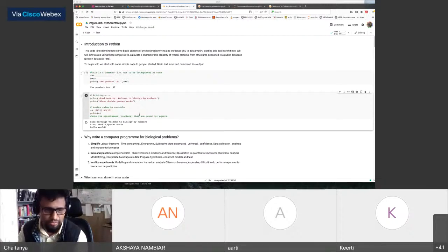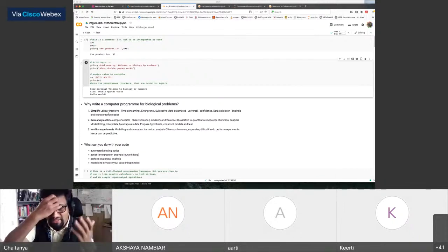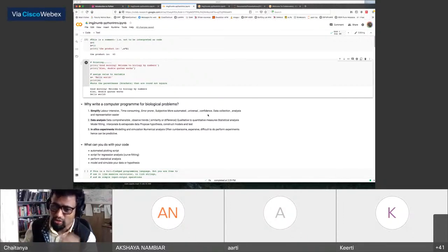are your output. So of course, why write computer programs for biological problems? You're here in this course, so I assume you don't need to know this. You don't need this to be explained to you, but it is simplification of labor-intensive, time-consuming tasks. Those that could be error-prone and subjective, to make them more automated, universal, and confident in the analysis that you're doing. It also helps with data collection, analysis, and representation.